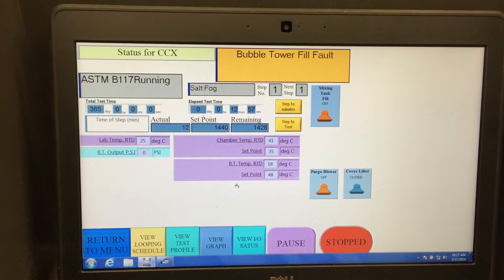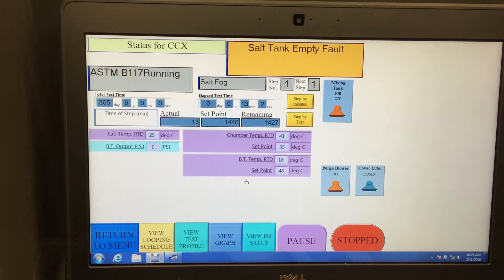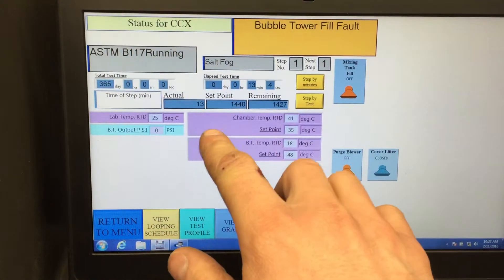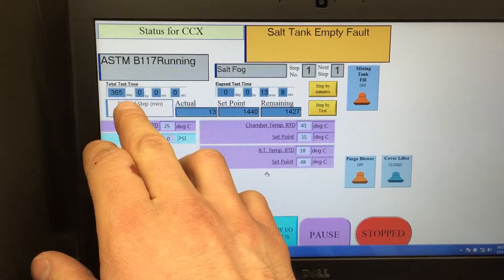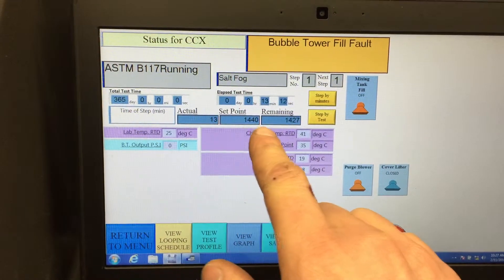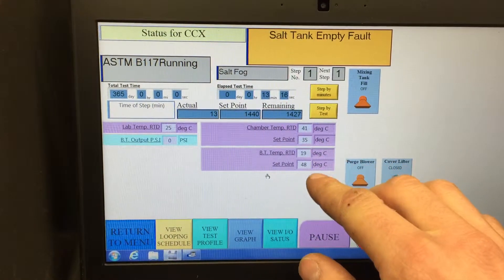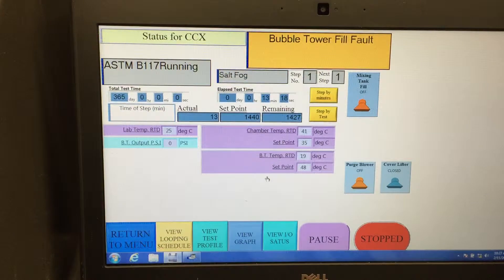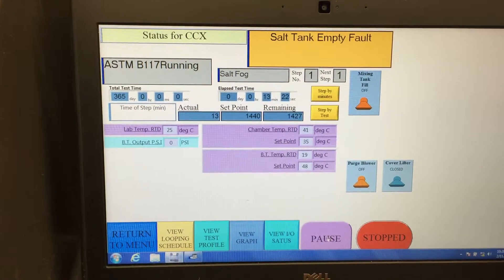You can see here that ASTM B117 is currently running. There's the total test time in days, set points for the time, the chamber temperature, and you can pause the test.